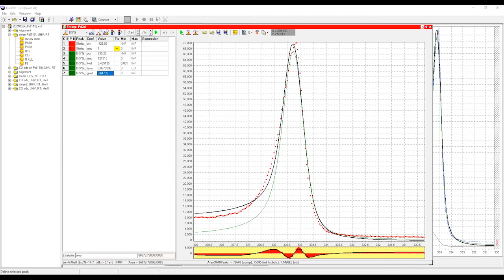We use it because it should be symmetric. We measure the profile and see if our peaks are symmetric, because when you move the monochromator and do some calibrations with the detector, the channels can somehow overlap, not in a good way, so you would have a bit of an asymmetric peak.